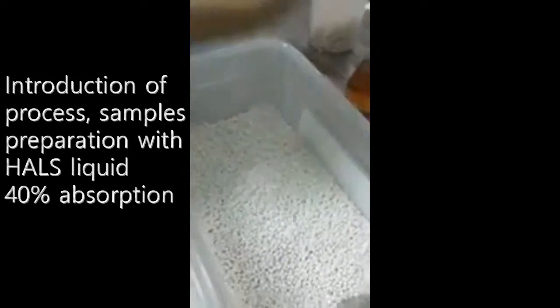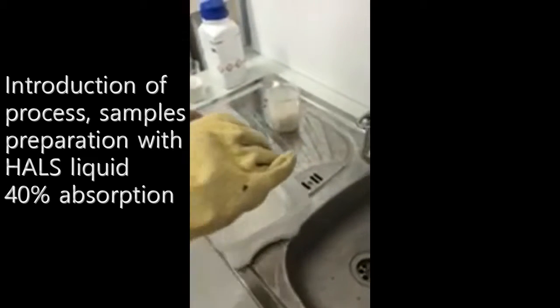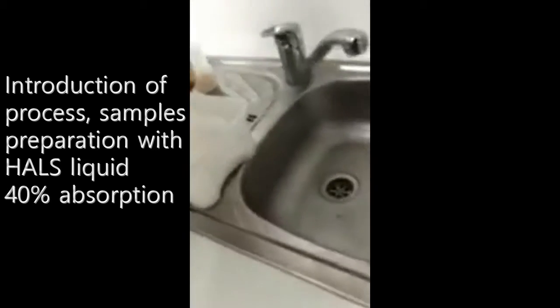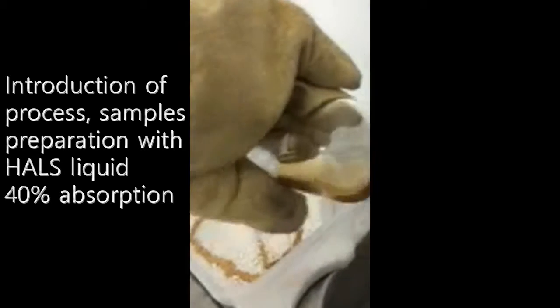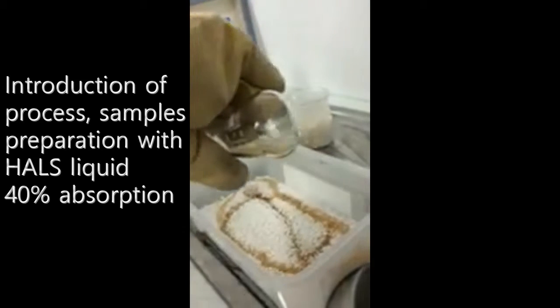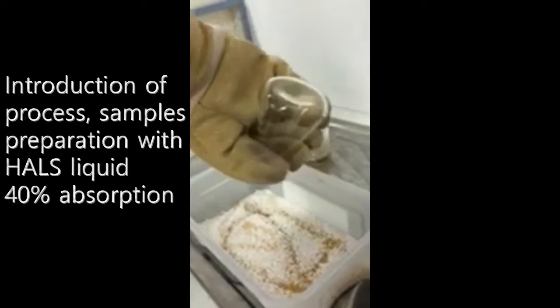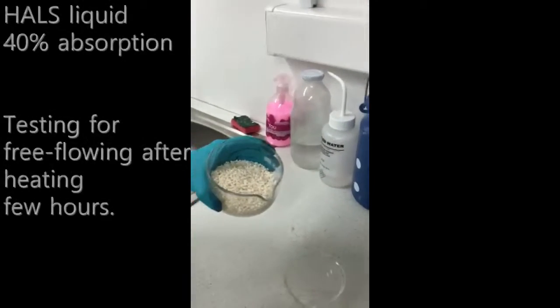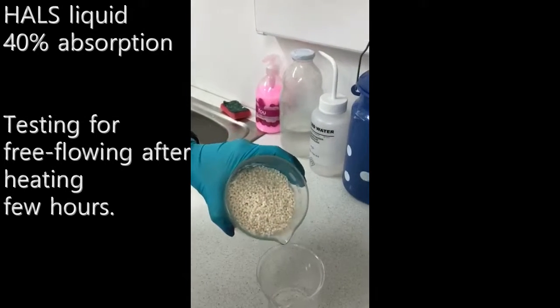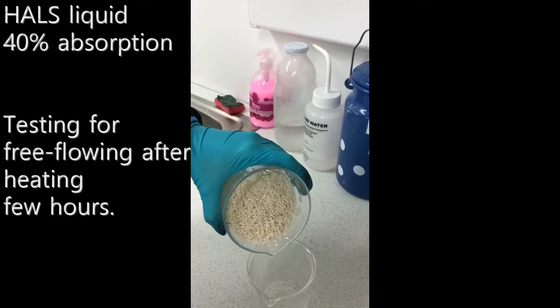These are porous granules, and we will present the prepared sample for absorption. We test porous granules after storing at 50 degrees Celsius during 3 hours.